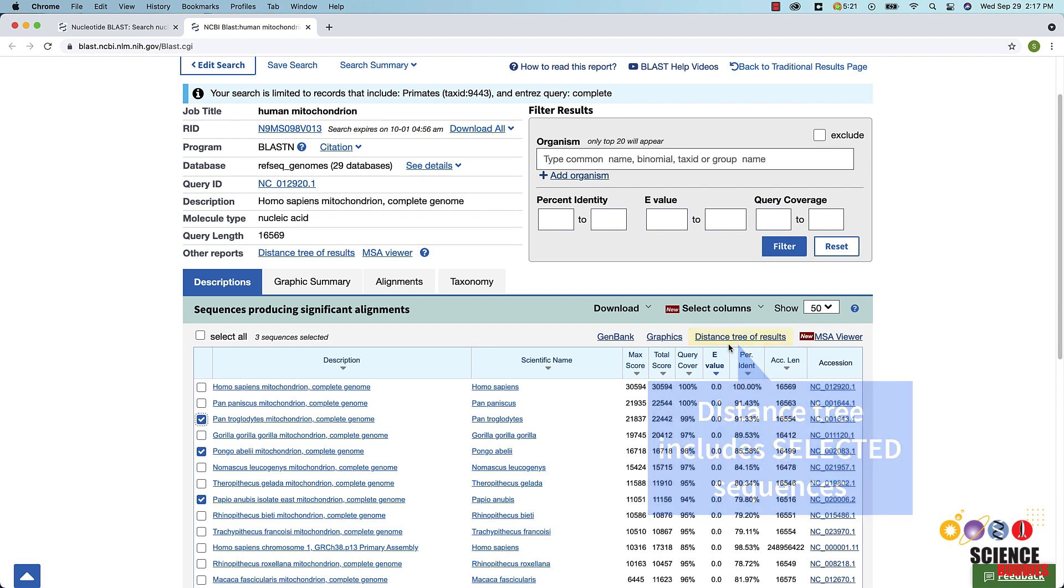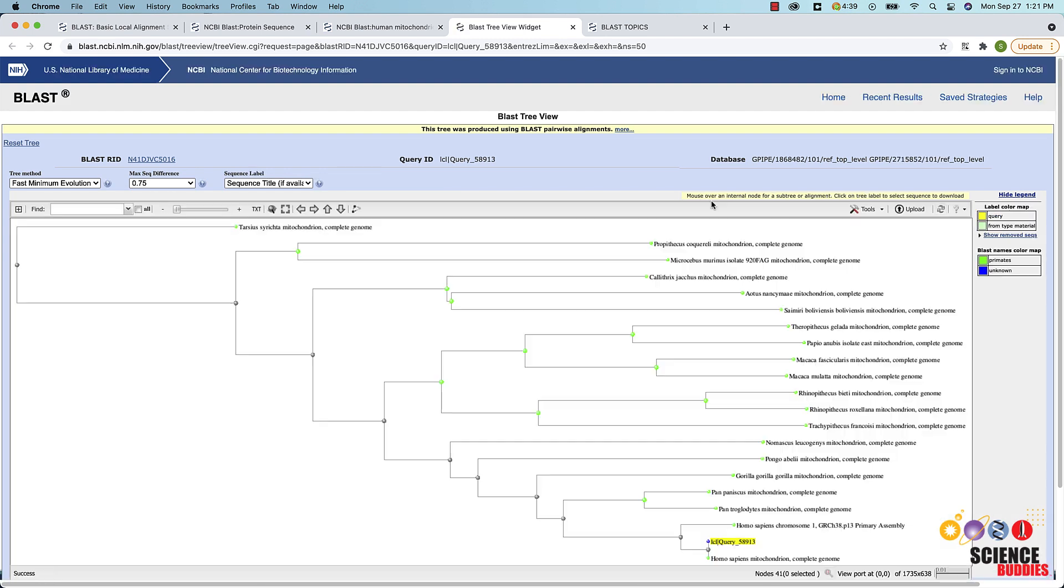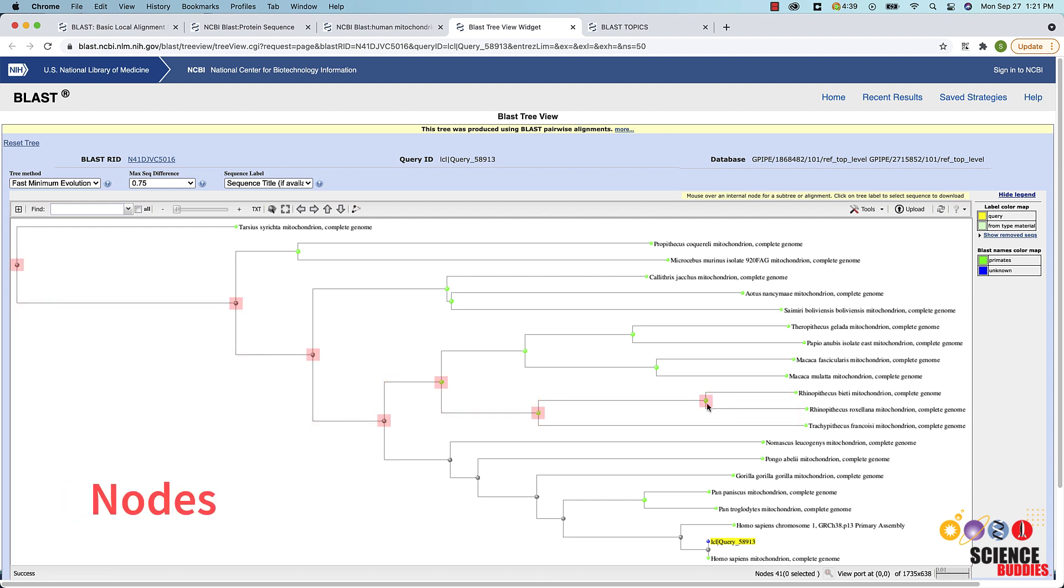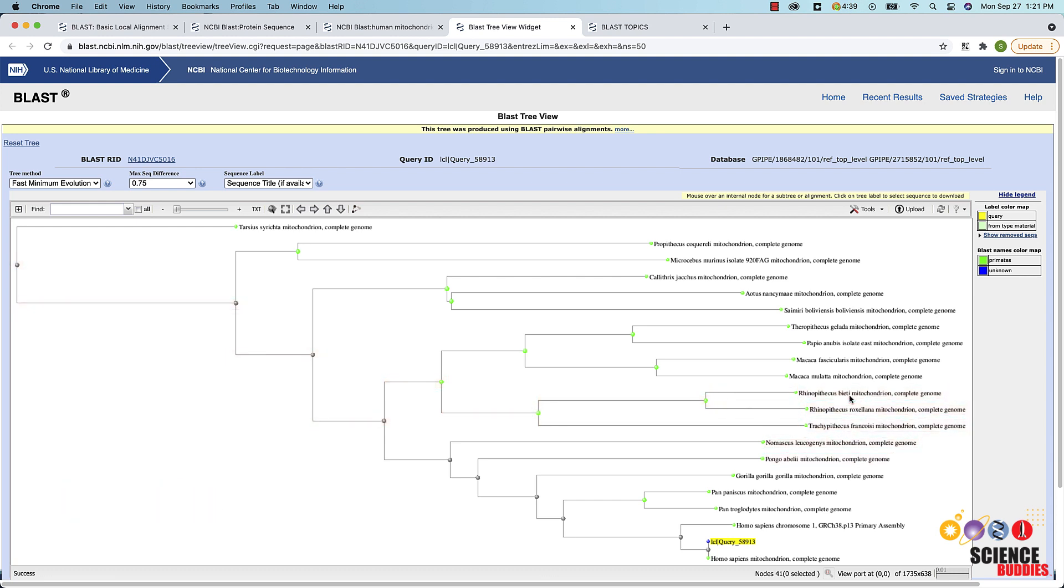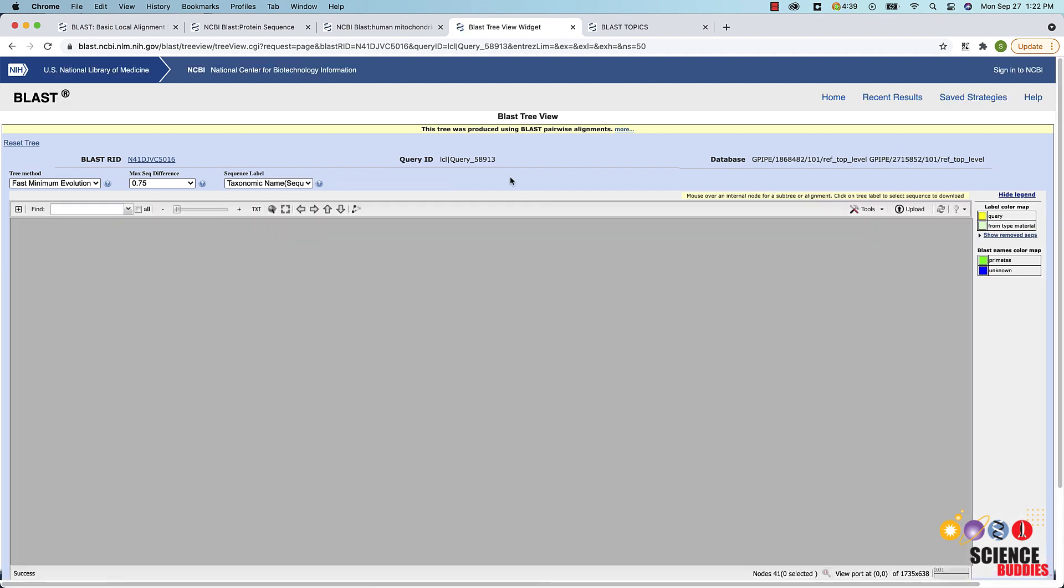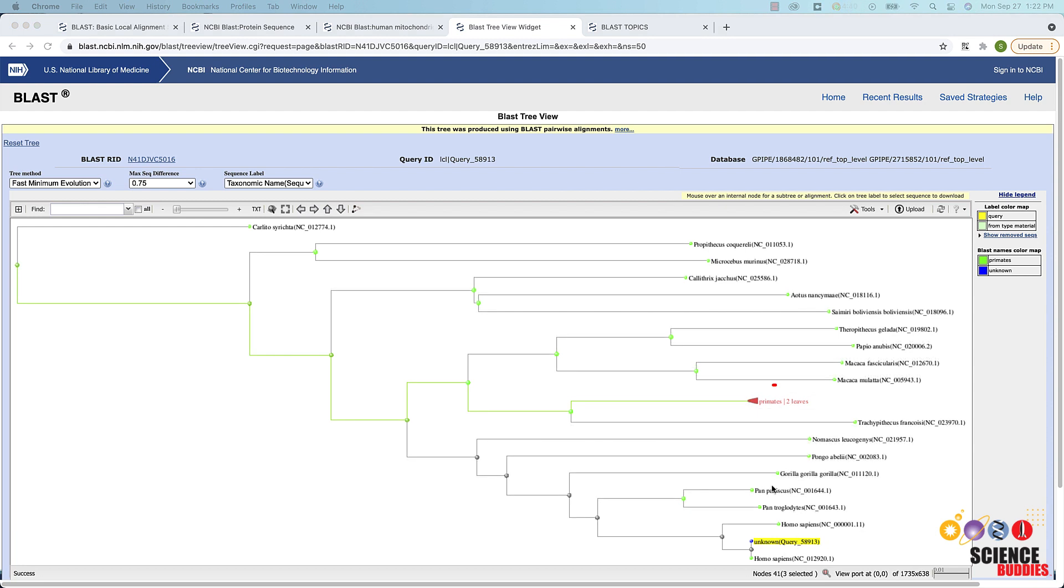The distance tree of results link opens a new page. The phylogenetic tree consists of branches, nodes, and the labeled leaves. It might be helpful to change the sequence label to a taxonomic name in the drop-down list. Your query sequence is highlighted in yellow. A triangle indicates when multiple sequences are clustered together in one leaf.